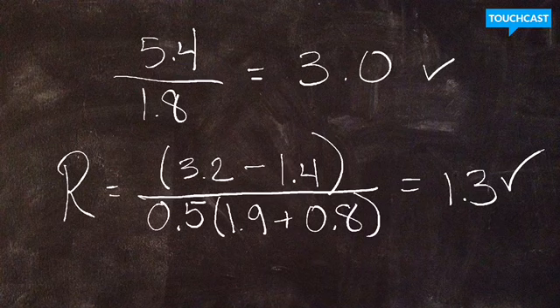All right, everyone. I really hope this has helped you out quite a bit. So please take this lab as just understanding that we're trying to effectively separate solutions, and all of this data stuff that you just did is a measurement of the effectiveness of the separation.